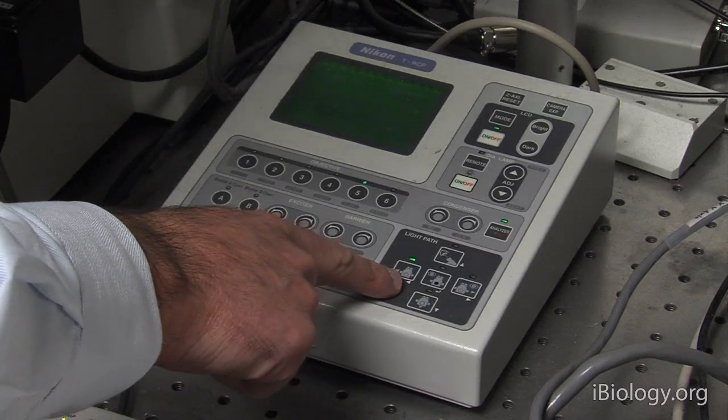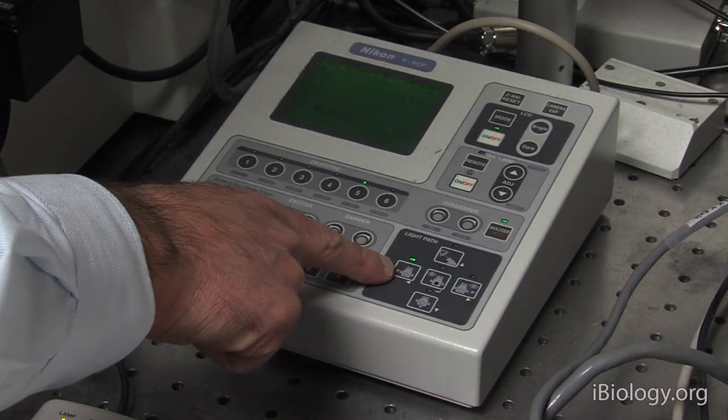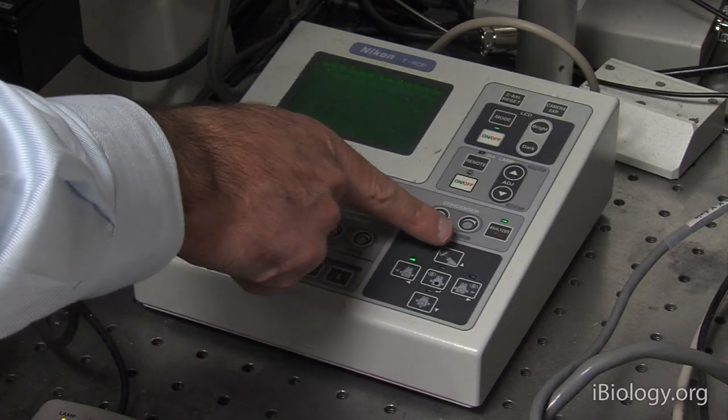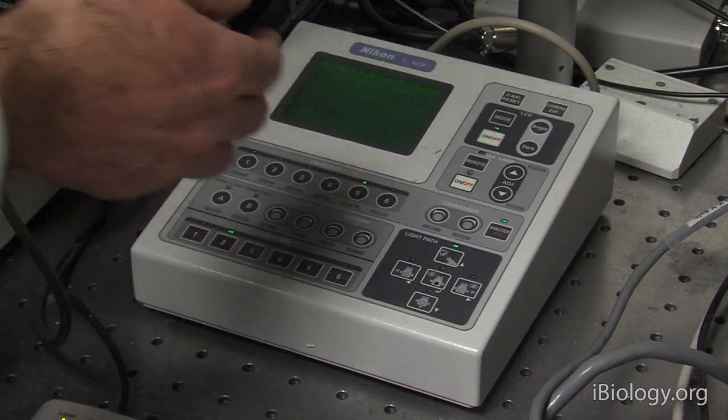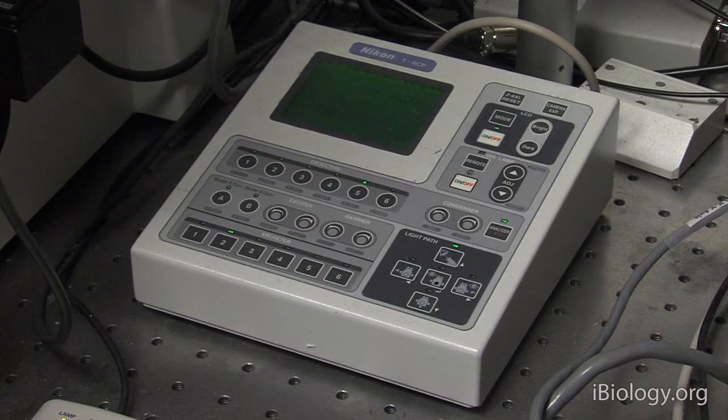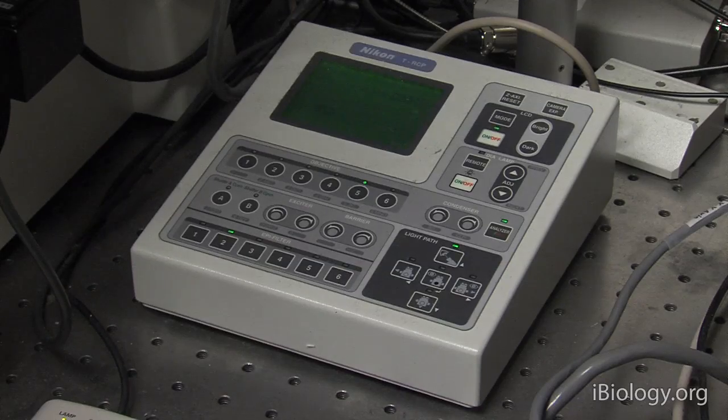In this case, actually, the light path is going to the camera, and so I need to switch it to the light path going to the eyepiece, and now I'm ready to start focusing and looking for fluorescence.